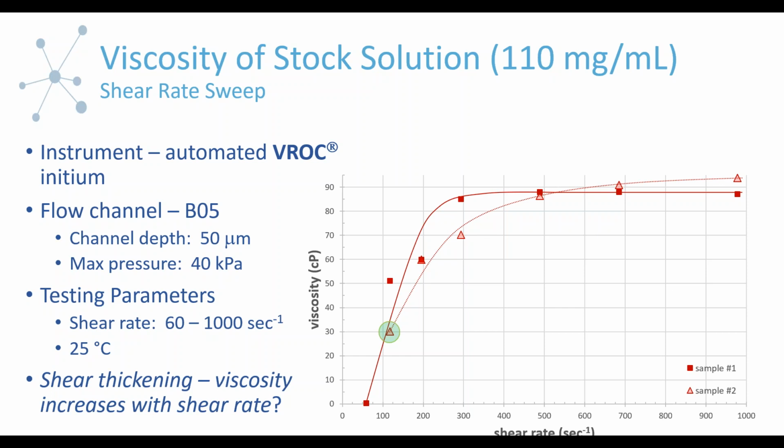And our testing parameters, we operated at 25 C, and we did a shear rate sweep from about 60 to about 1,000 inverse seconds. And so if we look at the data on the right in the plot, we have viscosity in centipoise as a function of shear rate. And we prepared two separate samples of the same concentration within some error. And what we see is viscosity looks like it is increasing with shear rate. And there's some slight variation between the two samples, but the general trend is there.